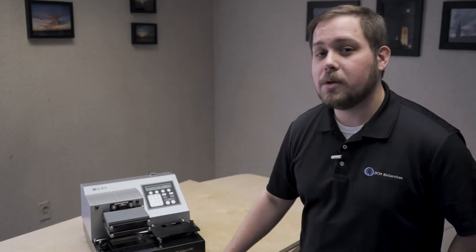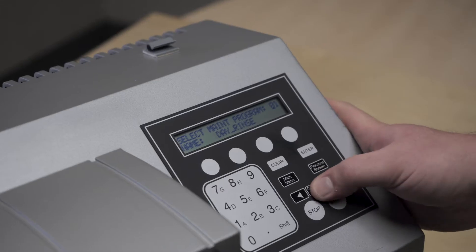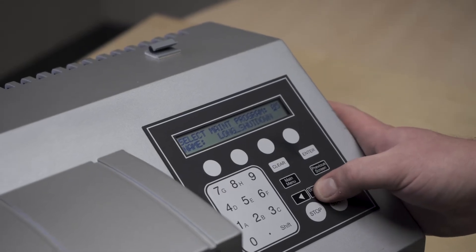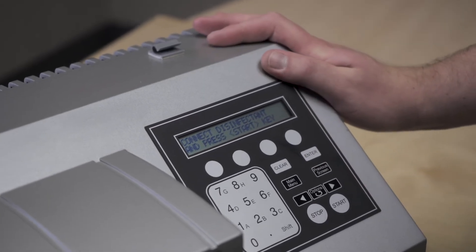To prepare a biotech plate washer for a long shutdown, a move, or even just storage, the first step you want to do is run the long shutdown maintenance protocol. That can be found in the maintenance tab and is titled 'Long Shutdown.' When you select it, it'll prompt you to connect the disinfectant bottle.